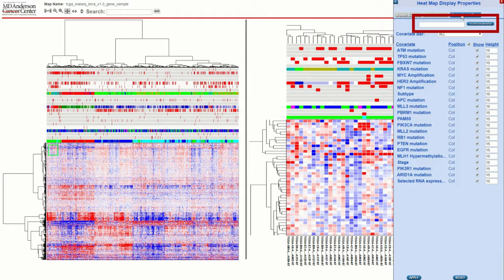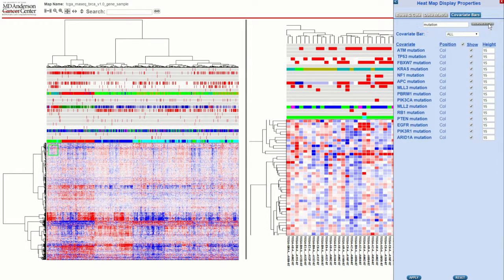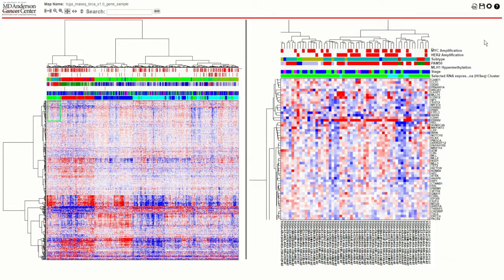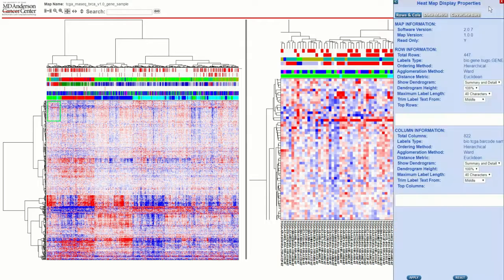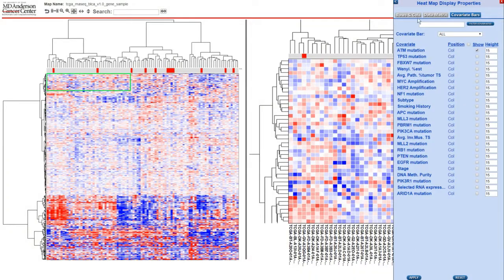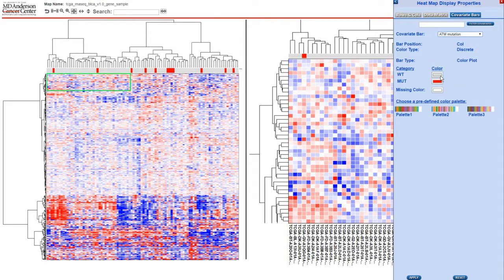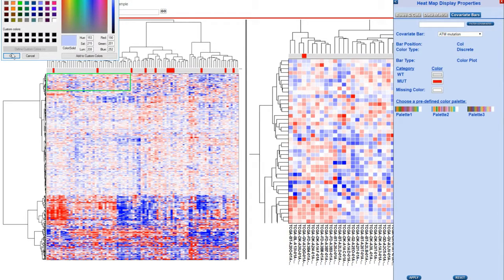If the heatmap has lots of covariate bars, the covariate filter can be used to select a subset of covariates. For example, 'mutation' could be applied as a filter to get a list of just the mutation covariates, and then the checkbox next to the show column could be used to hide all of the mutation covariate bars while the remaining covariates will be displayed. If a specific covariate is selected, the panel will change to look like this.